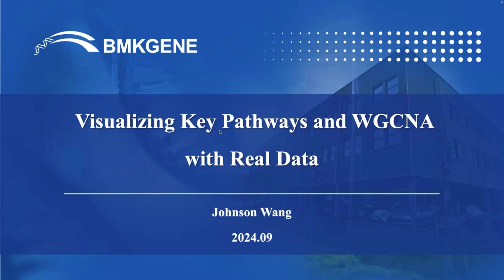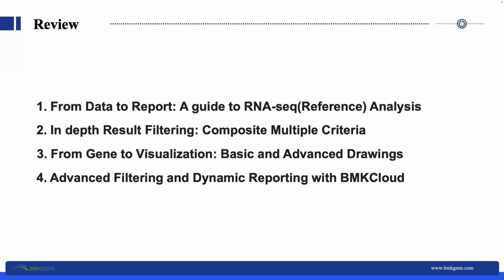Today, we will talk about visualizing key pathway and WGCNA with real data using BMKCloud. Long time no see. Let's review the previous webinars first. In the first 3 webinars, we went through the main functions in BMKCloud. We talked about how to submit analysis, how to download and update reports, and how to visualize your results.